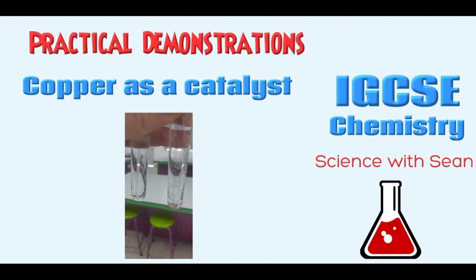Hello, today I'm going to demonstrate how a catalyst can affect the rate of reaction. So as you probably know, catalysts speed up chemical reactions without being used up themselves. So let's see that in action.